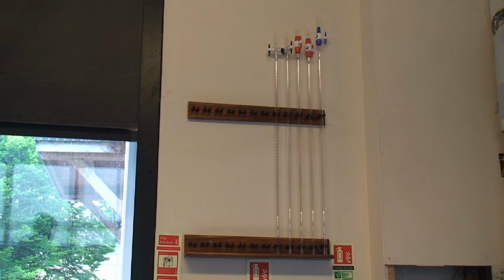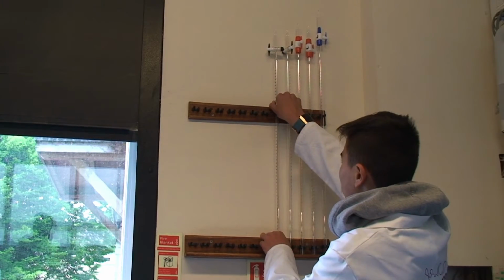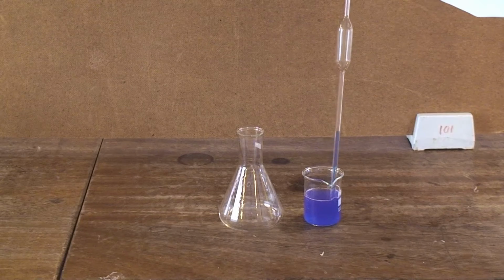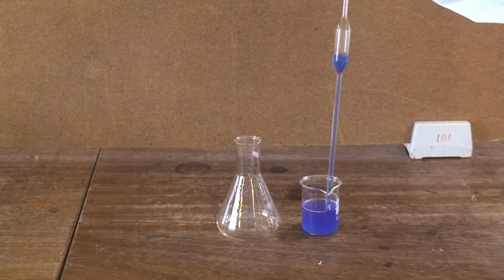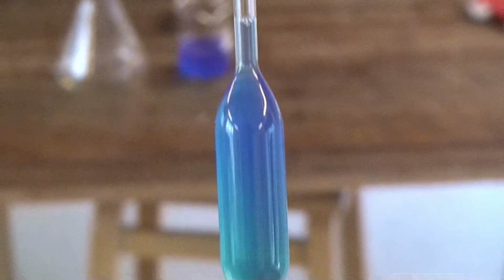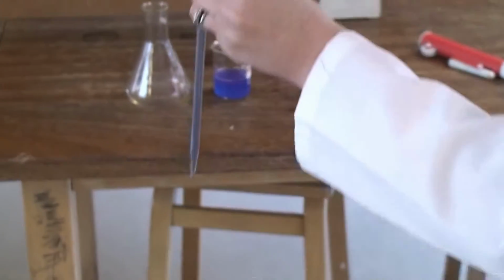When removing the burette off the wall, carefully pull both the top and the bottom of the burette towards you to avoid any damage. It's always good to practice using a pipette beforehand, so that when it comes to the real experiment you can be confident when handling the solutions. When you fill it up, you want the solution to reach the line, as shown here. We have dyed some water blue so that it's easier to see.